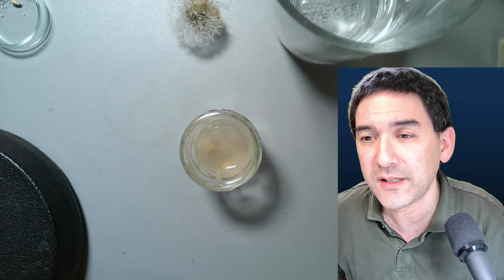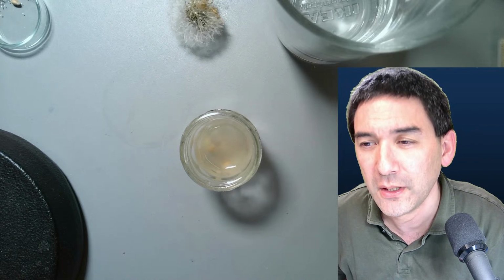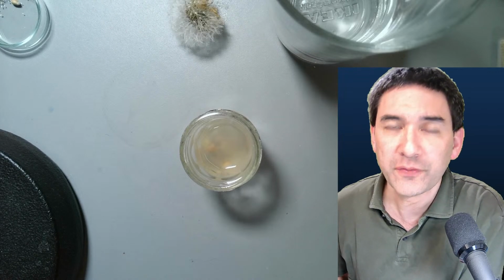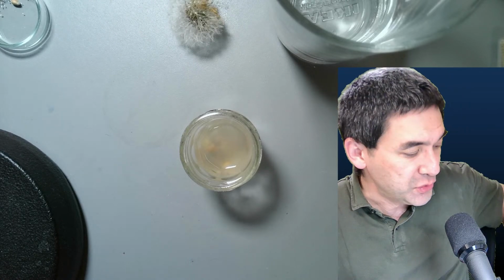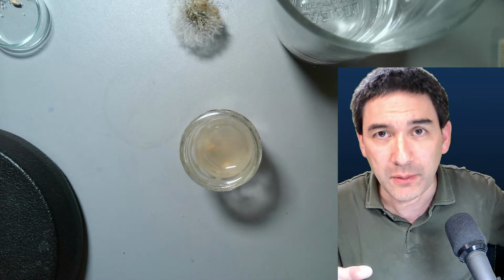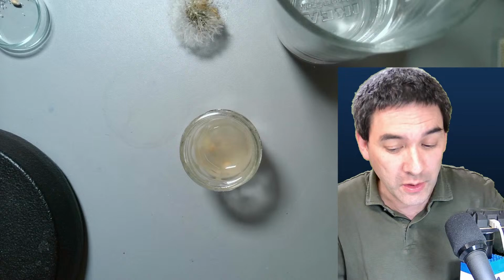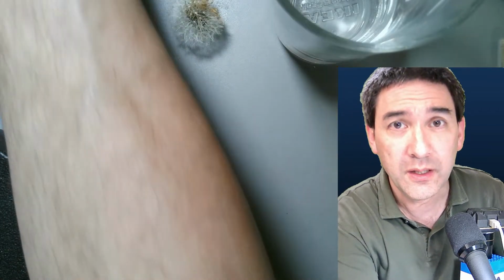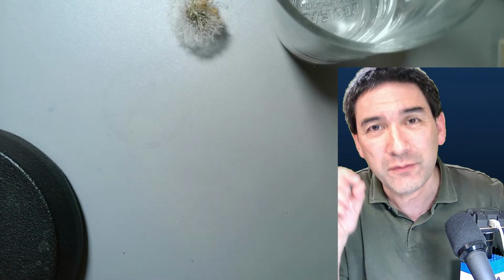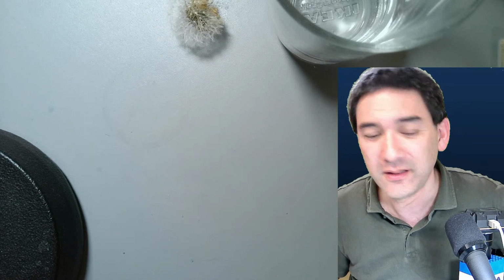Should I use the camera that came with my microscope to see better? I'll tell you the following. It's a question of taste. If you want a camera connected to your microscope, it can be more convenient if you have a screen, and some people with vision problems might like to work more with a camera and a screen. However, the image quality is generally much better if you look directly through the eyepieces.